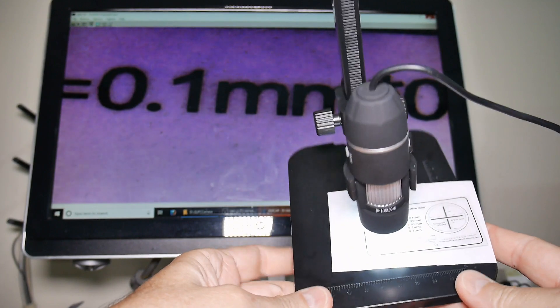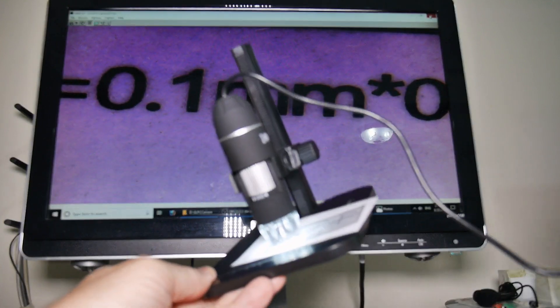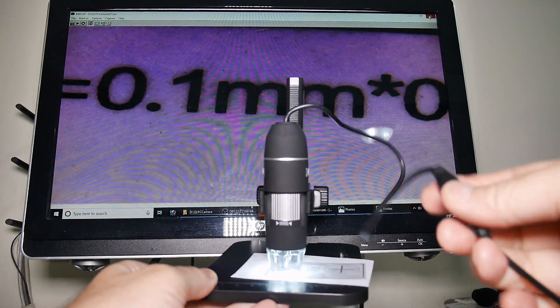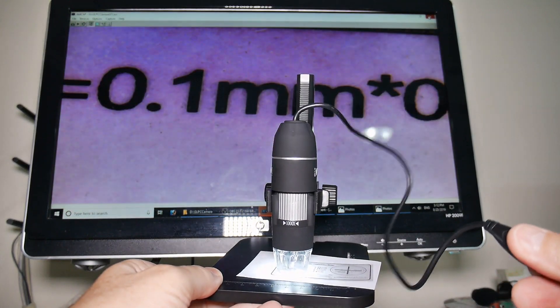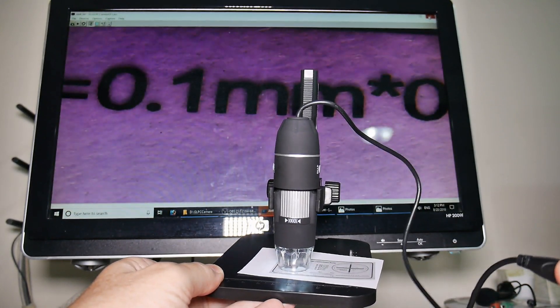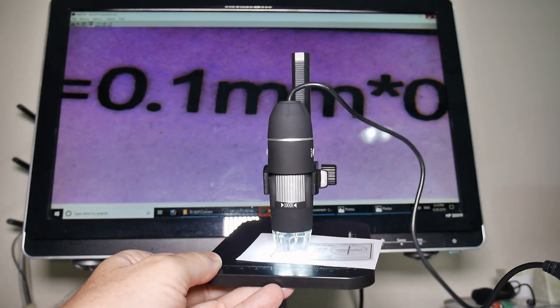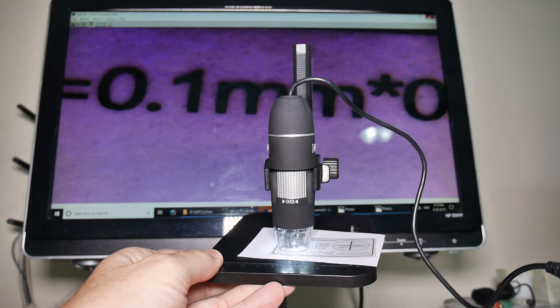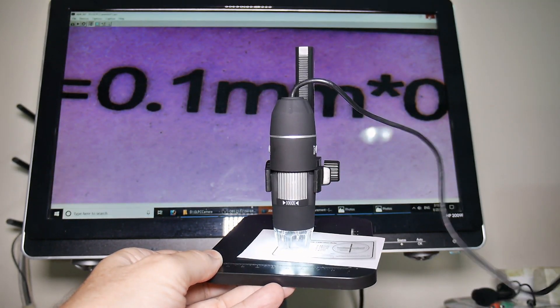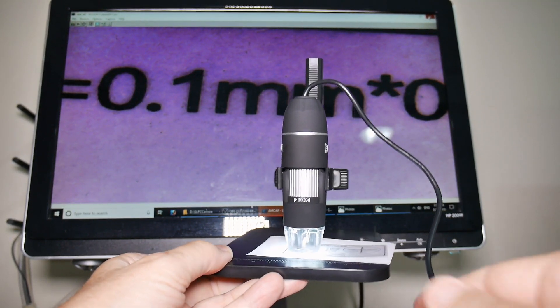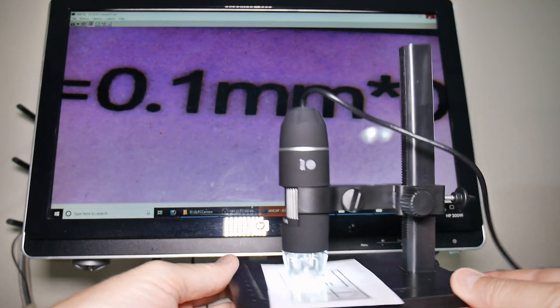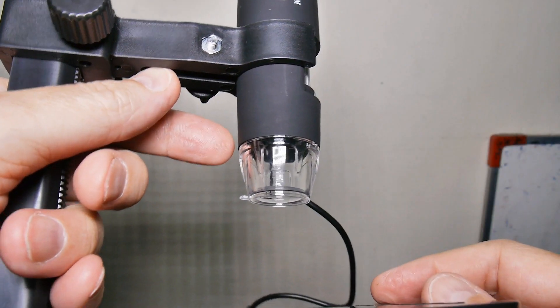I think I mentioned this earlier, but this is the brightness control. You can turn the brightness up and down, you can see it changing on the microscope. Yeah, that's about it for operation.